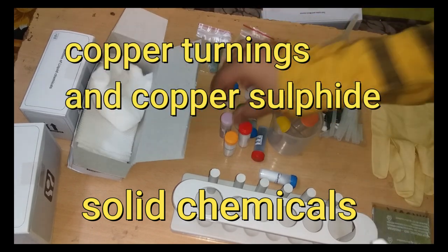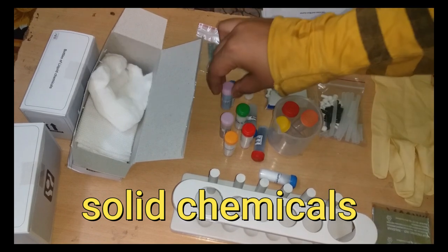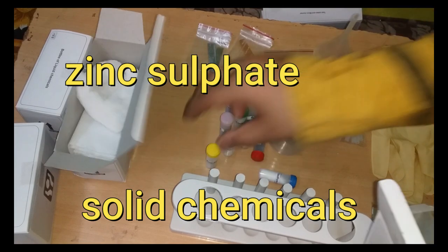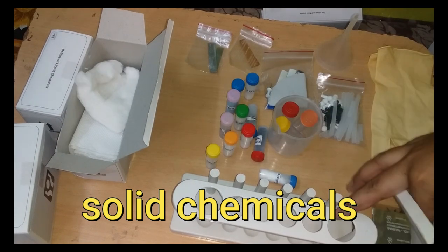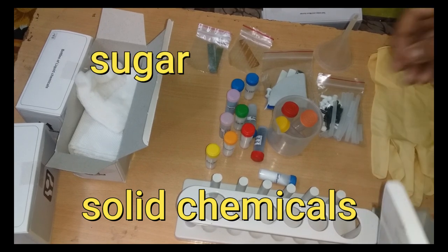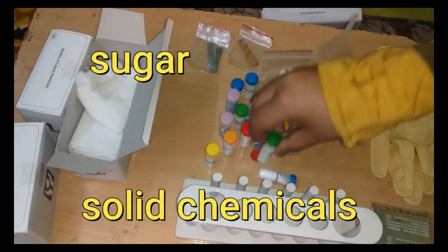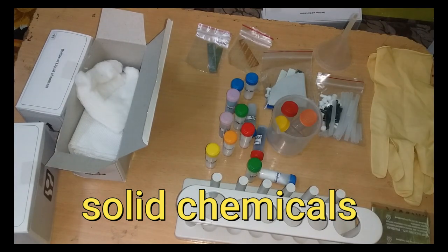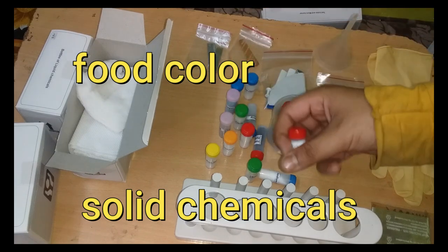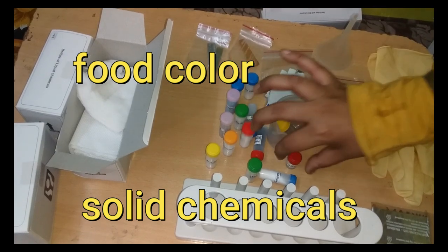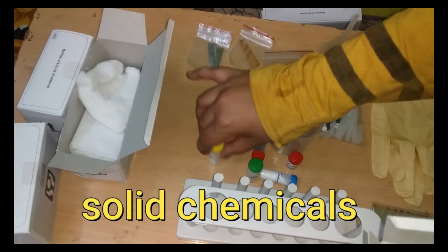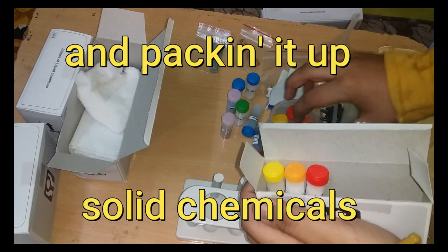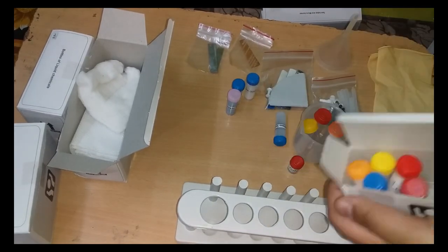There's copper turnings, this is copper sulfate, and this is zinc sulfate. After all, as you can see, this is sugar. I forgot to show the food coloring - this is green by the way. That's all, now just pack it up.